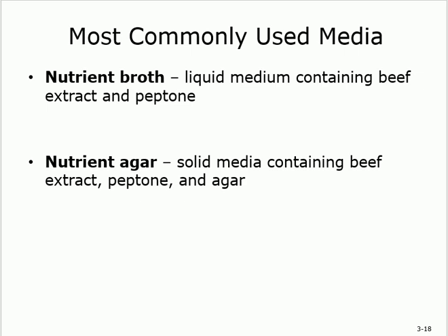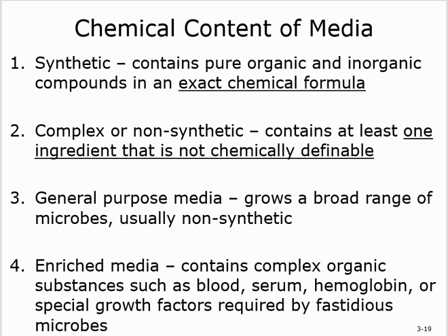Okay, so nutrient agar is an example of solid, nutrient broth is an example of liquid, semi-solid is not used that much, but it still exists.